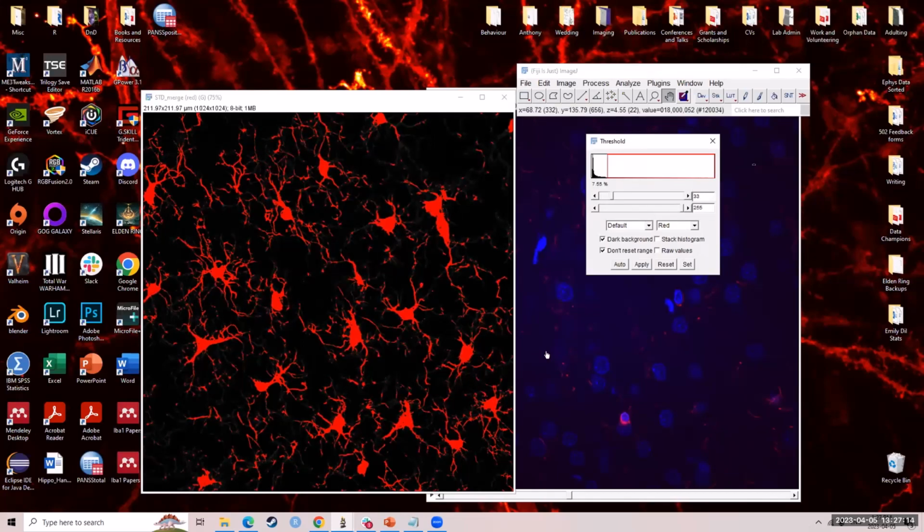Questions coming for you, Hannah, in the chat if you want to take a look. One about blurring filters, and there's another one after that. Okay, I see.